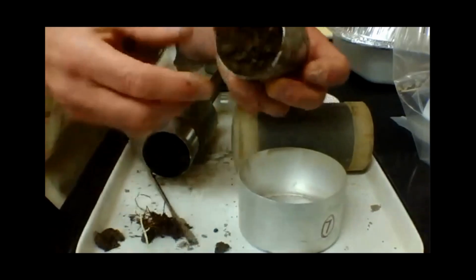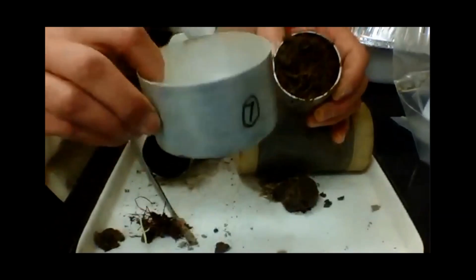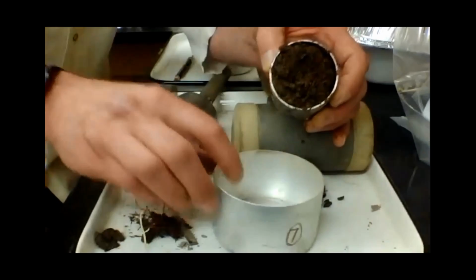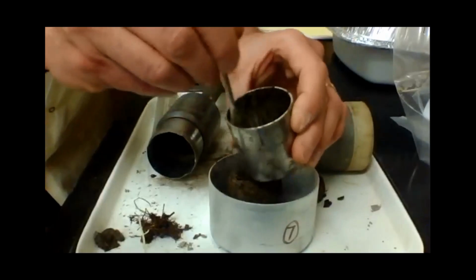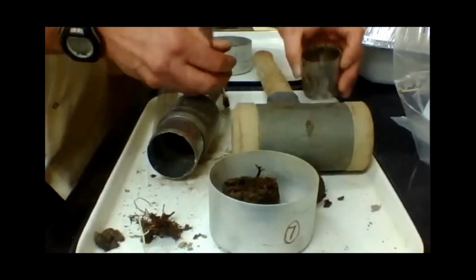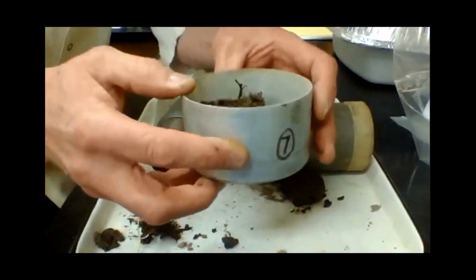So we're going to take this sample in the ring and then put it in a soil moisture container. We've pre-weighed this so we know what the weight of this container is, and then we're going to push the soil from within the core, the soil bulk density ring, into the soil moisture tin, as you can see here.